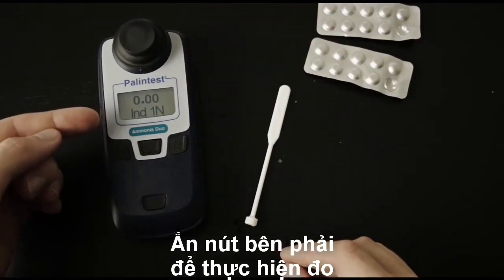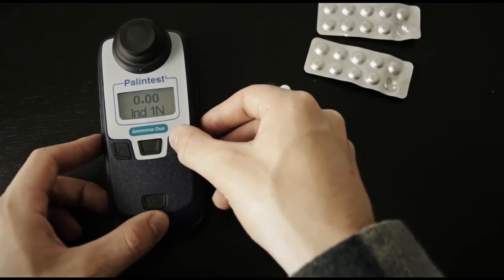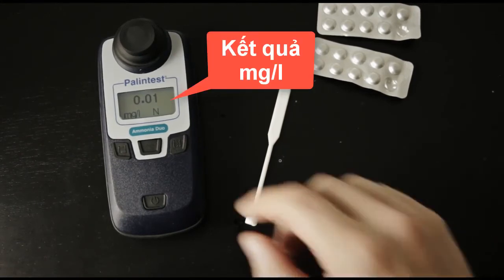Make sure that the Indophenol 1N test method is still selected, and use the right test button to take a sample. The result is displayed in milligrams per liter.